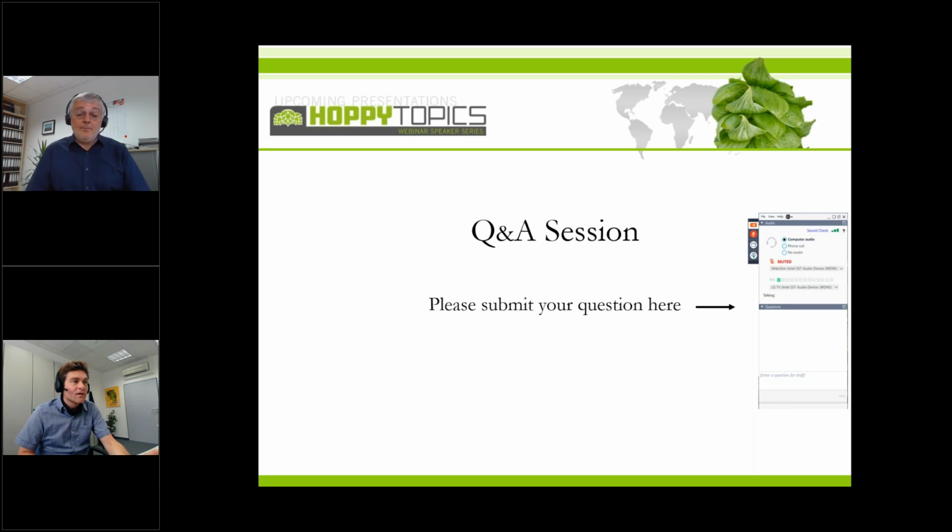Another very concrete question regarding headspace analysis. Is there a problem that components might decompose when headspace analysis is performed at a high temperature, such as 85 degrees? Yes, of course, we looked at this carefully, but we did not see any degradation. We are adding the labeled standards.